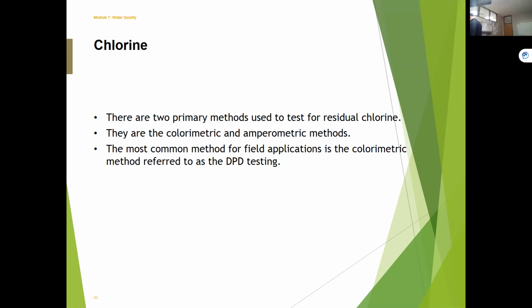Now, back in the day, and again, we'll go back to these color wheels, these color wheels are the same thing. I wish I had a light that I could show you, but I have a color wheel here and I put my samples in here and try to figure out, can I see what's going on? That is a very early chlorine tester. Again, very subjective, because I have to hold it up to the light and figure out what's going on here. It will tell you, well, that color is 0.8 or so. Again, very subjective. It doesn't really spit out a number.